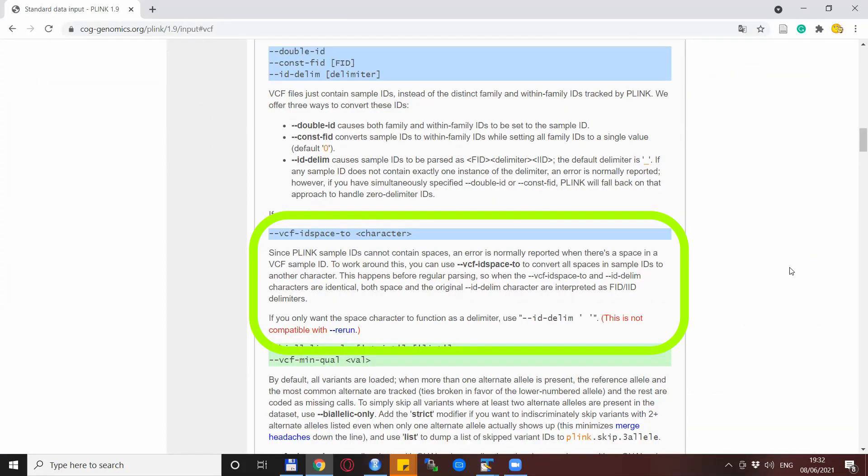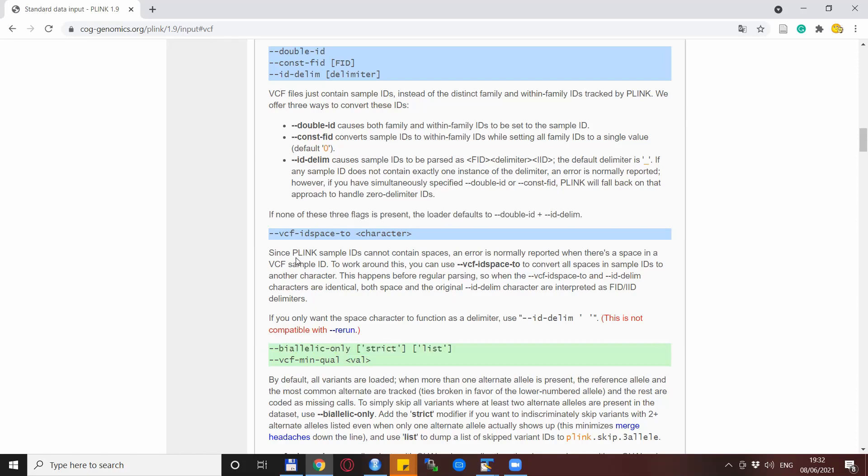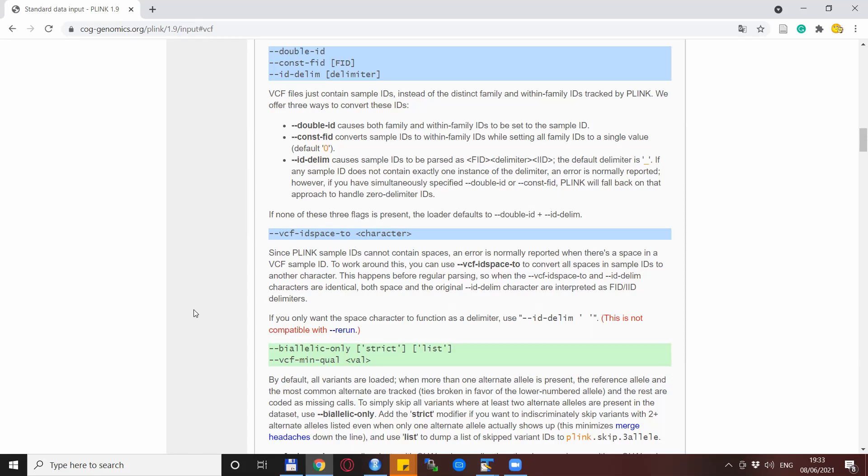In addition, I want to highlight another potentially very useful option in Plink. And that is to replace the space characters in the VCF IDs, if it's the case. In our case, it was not necessary because we didn't have any spaces. But in general, I know that dealing with spaces in file names and especially in IDs is a big pain. So having this option is really good to solve these situations in a quick way.